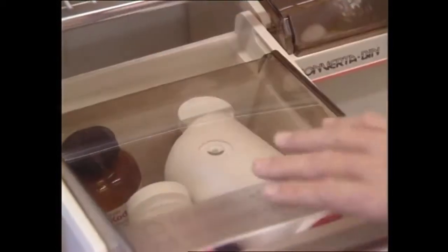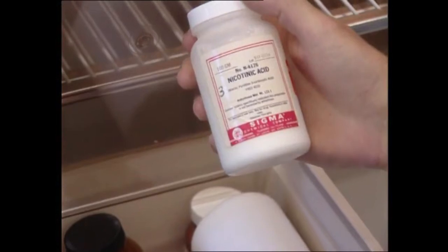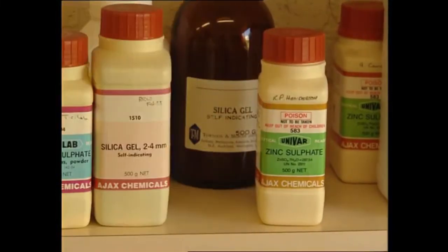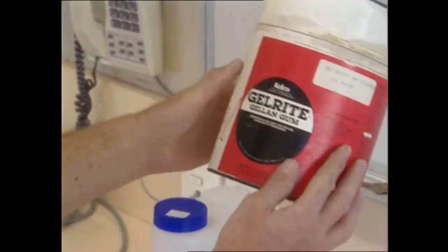These are all the macro and micro elements, the vitamins and other growth factors such as myoinositol, glycine, nicotinic acid, pyridoxine, thiamine, etc. To this mixture, we also add sugar as a source of energy and plant hormones when necessary, as well as a gelling agent.